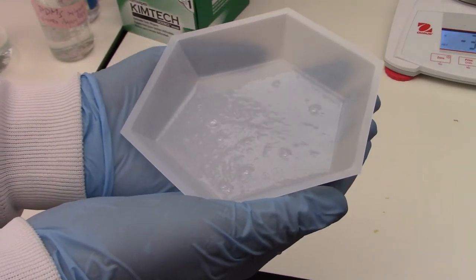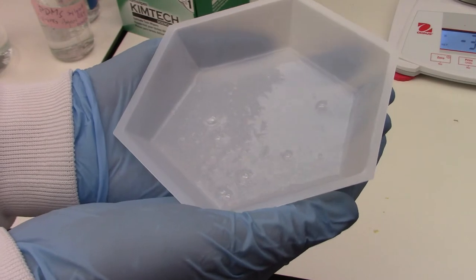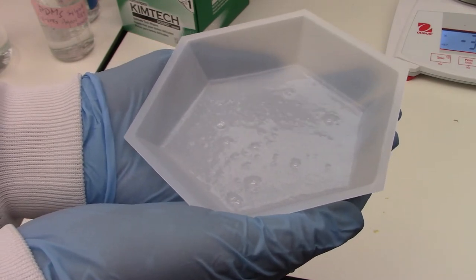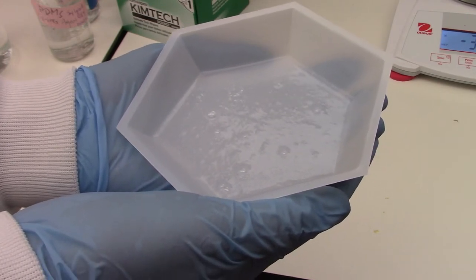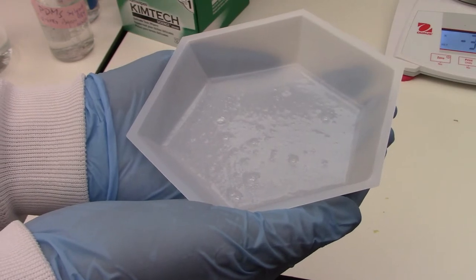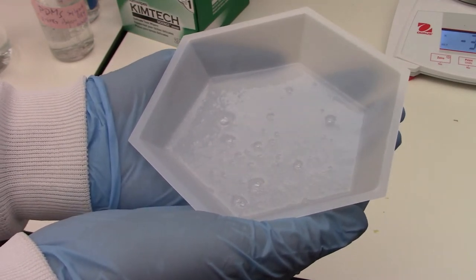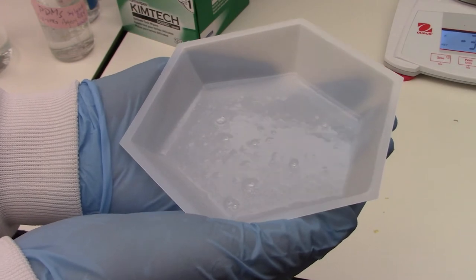Now that we've mixed these two components together, you can see there's a lot of bubbles that form during the mixing process. So what we're going to do next is put this into a vacuum chamber and use that suction to help pop and get rid of all these bubbles.